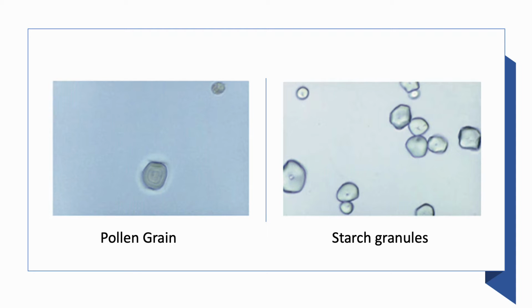So what we can do is use polarizing microscopy to identify a Maltese cross from an actual fat droplet. A red blood cell can be differentiated from these starch granules by considering other urinalysis results, like the chemical test positivity for blood and protein, and also the presence of oval fat bodies or fatty casts, which can differentiate these starch granules from the fat droplets.